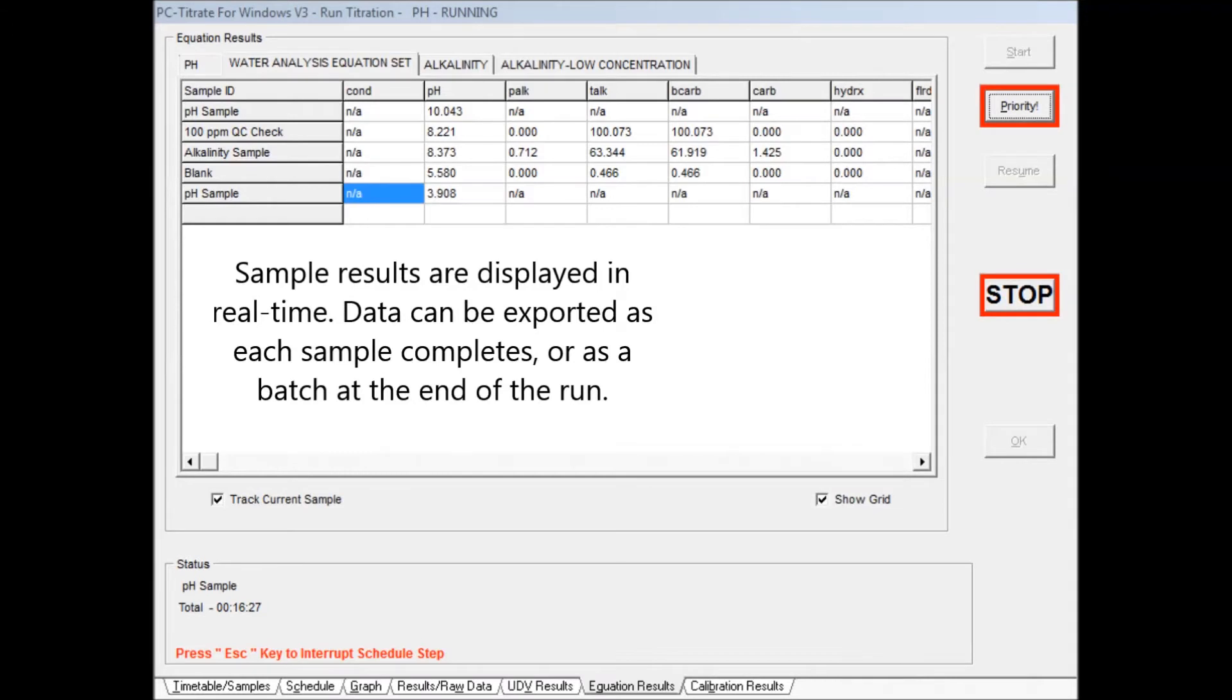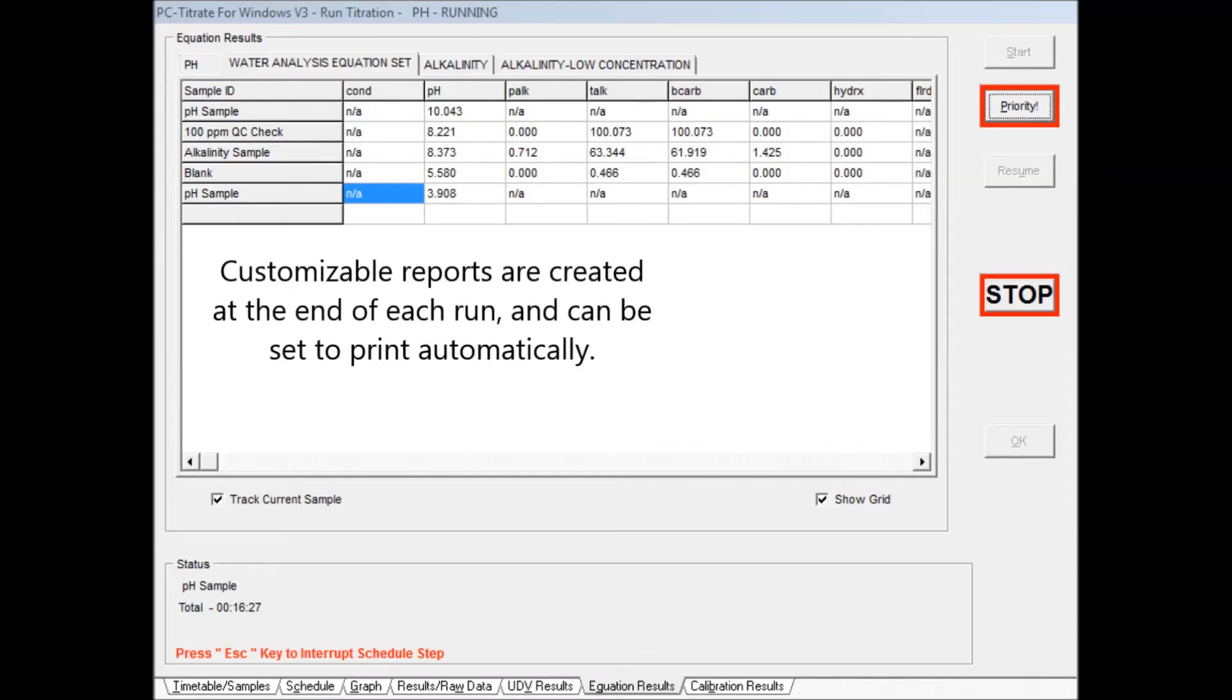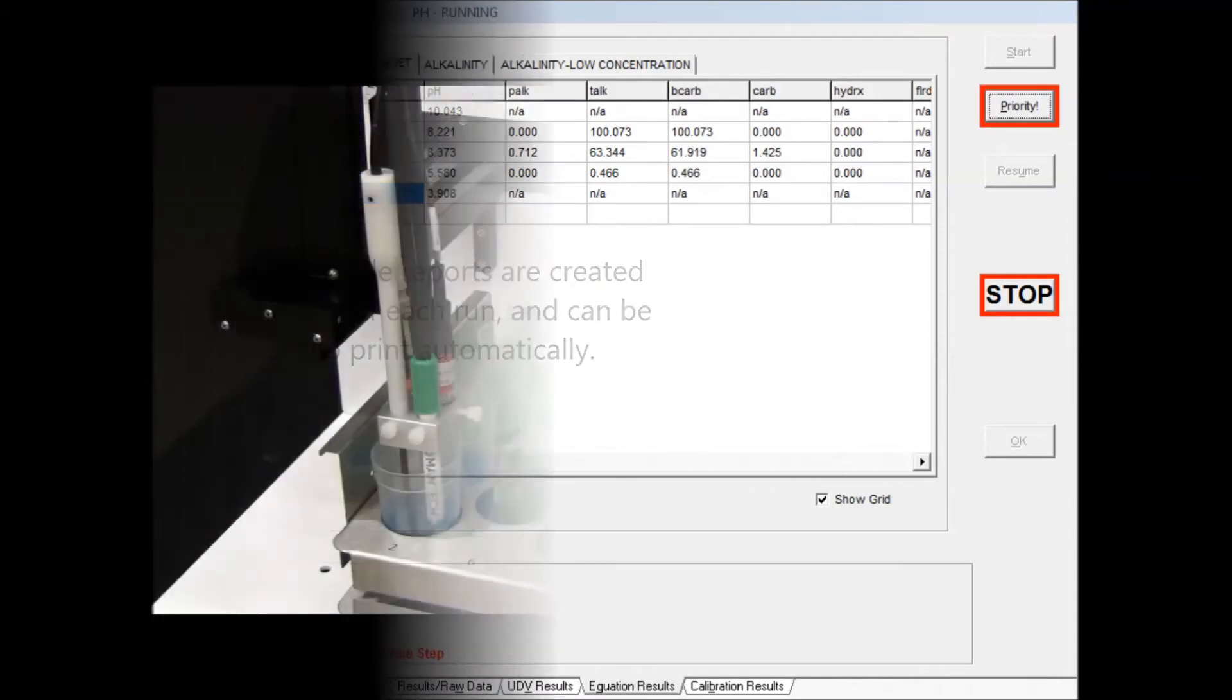Sample results are displayed in real-time and can be exported as each sample completes or as a batch. Customizable reports are created at the end of each run and can be set to print automatically.